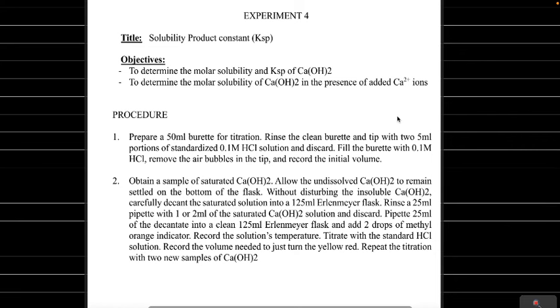You realize that not all the salt is going to dissolve in the water. Once the water has taken what it's able to take, you decant it, discard the solid and keep the liquid that contains the salt. So basically, that's what we are doing here. Once you're done decanting it, record the solution temperature.